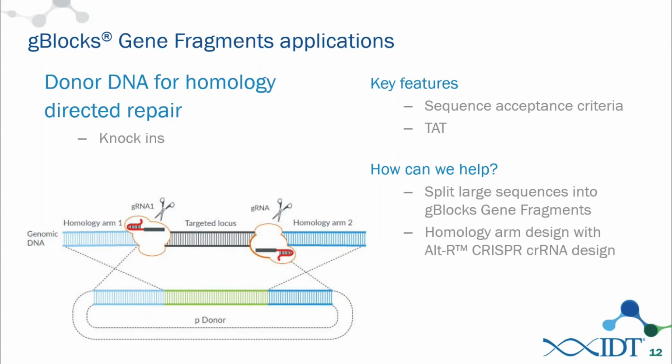Again, the most stable condition that we found when we've looked at storing things in pure water, storing things in TE, and storing things dry is actually storing them in TE. We were a little surprised at that. We thought that storing them dry would be as good or better than storing them in TE.